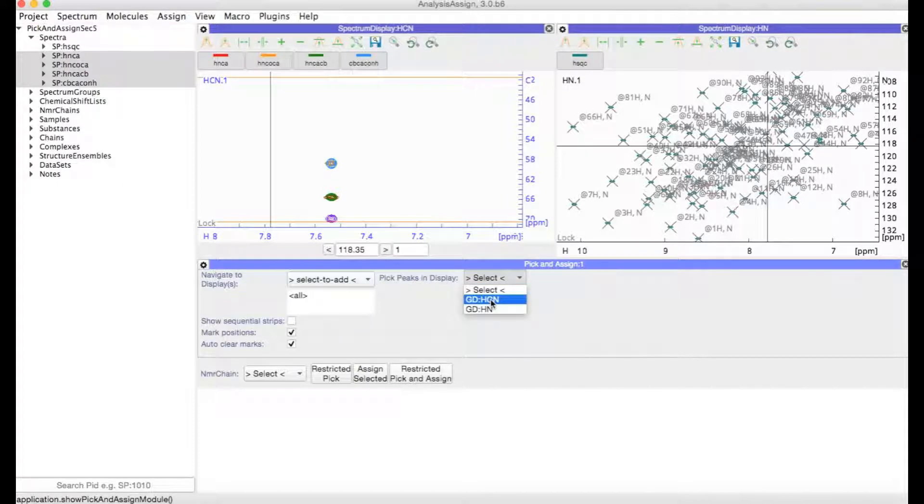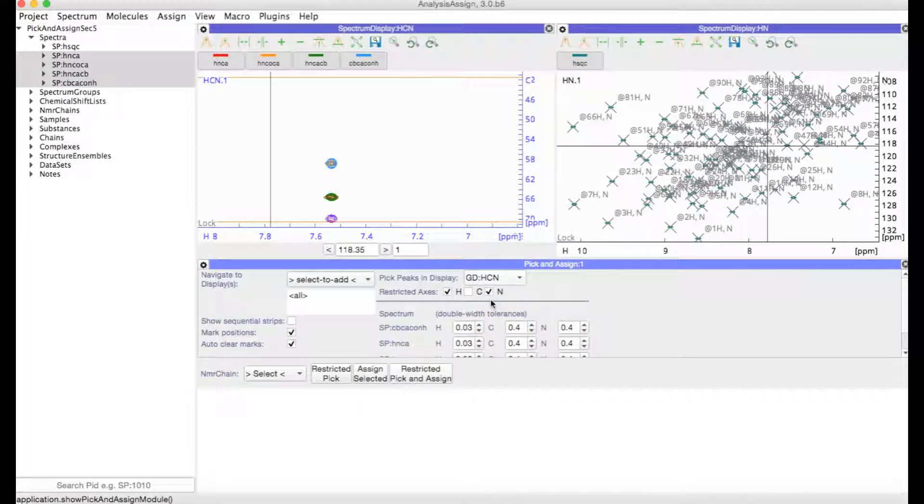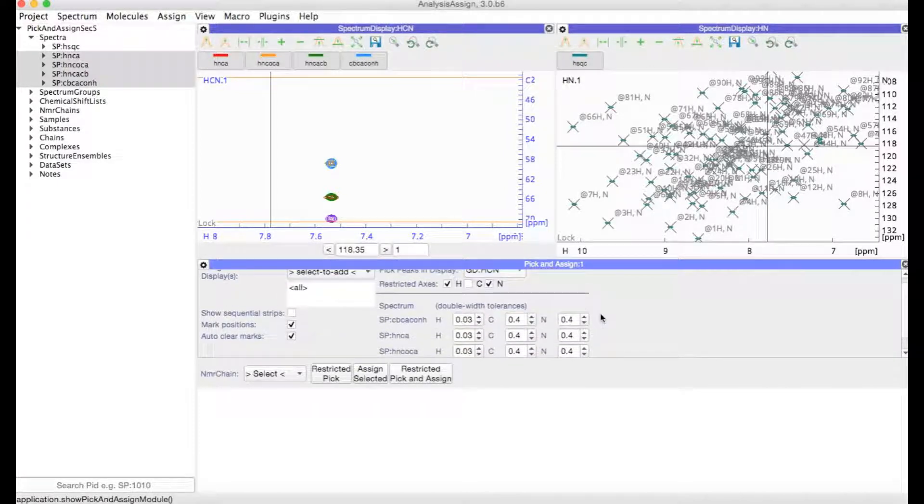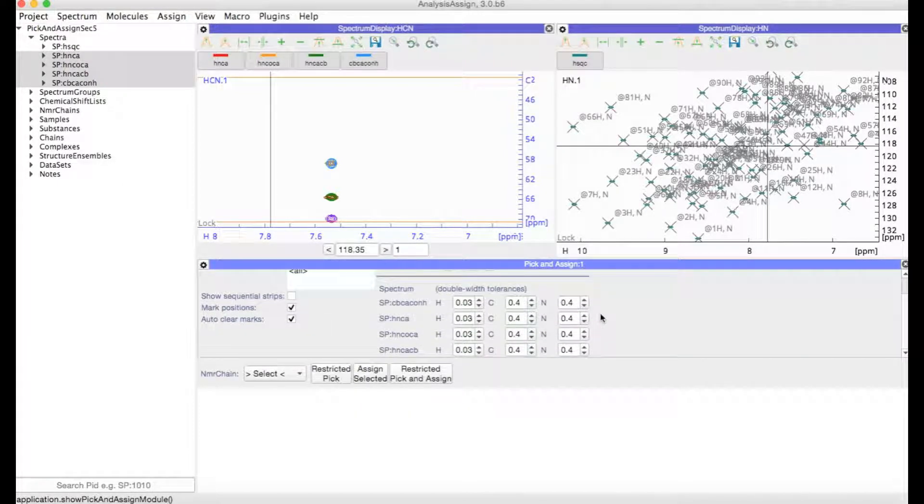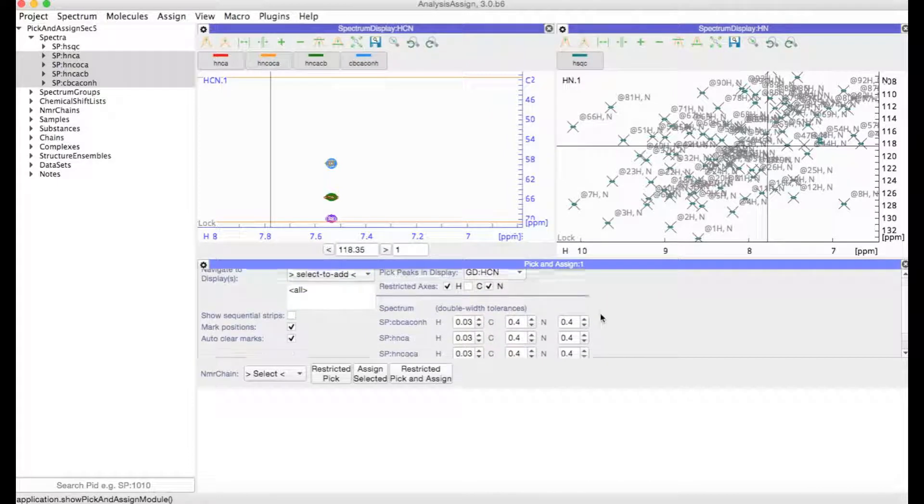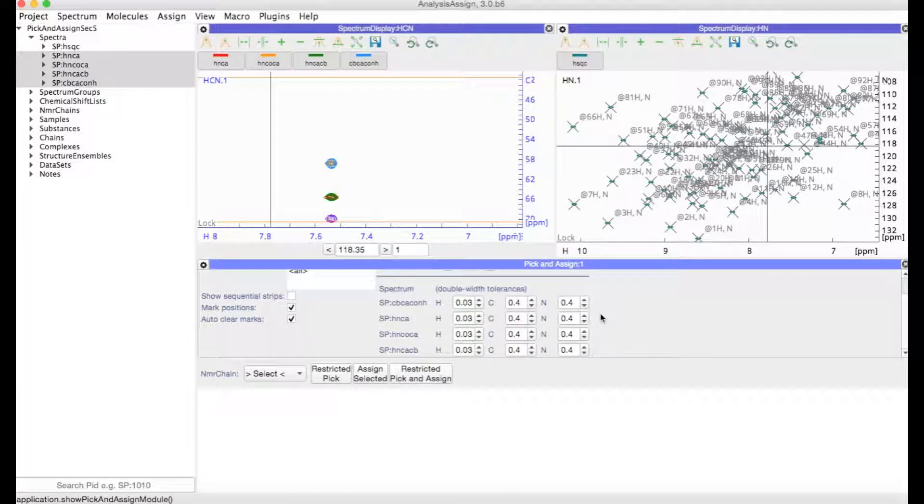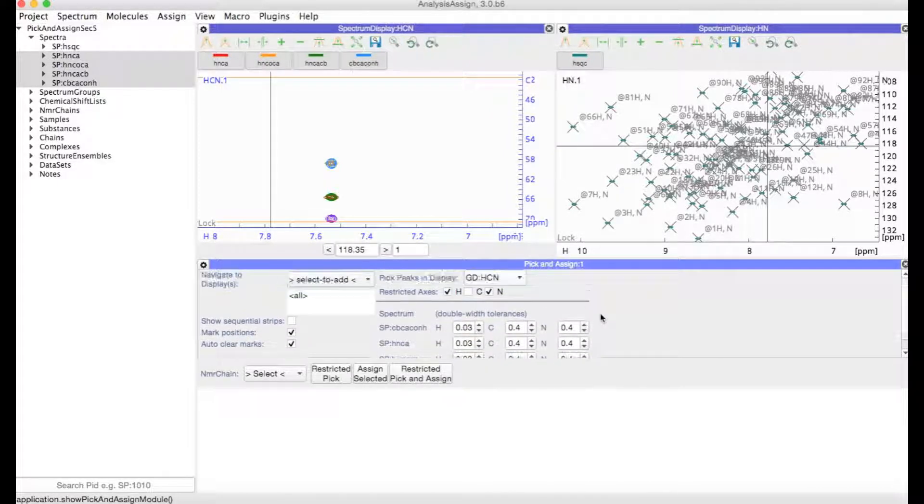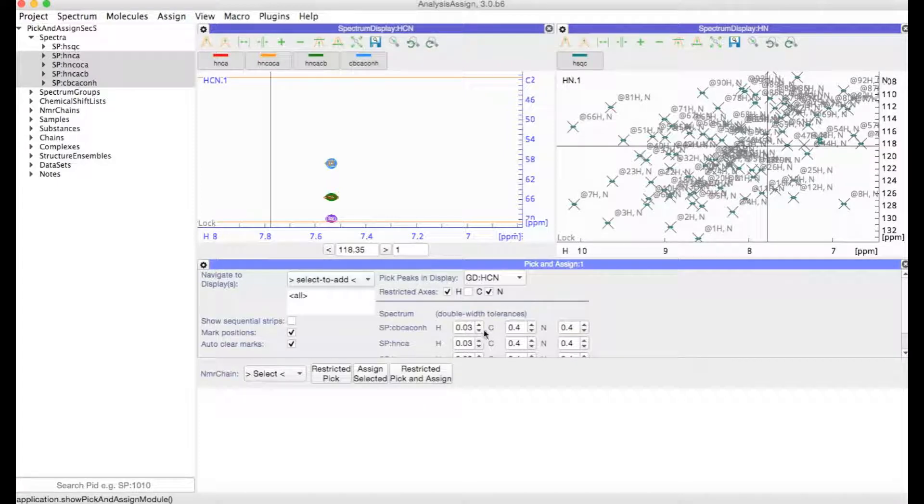Select your 3D display and you will see then that you get this little table. We don't need to make any changes to this at the moment, but if at a later stage you would want to change the tolerances with which your peaks are picked, then you could do that here.